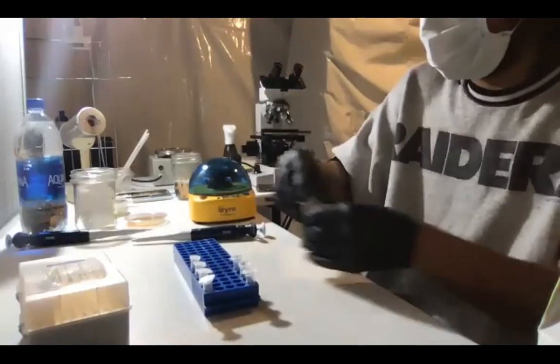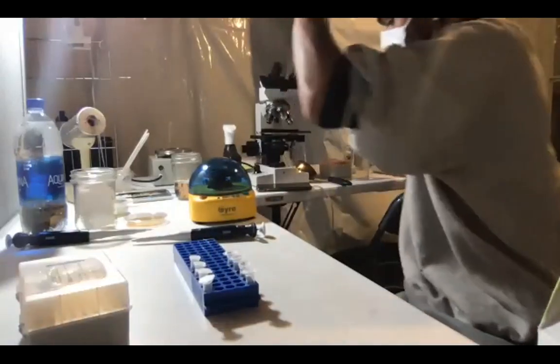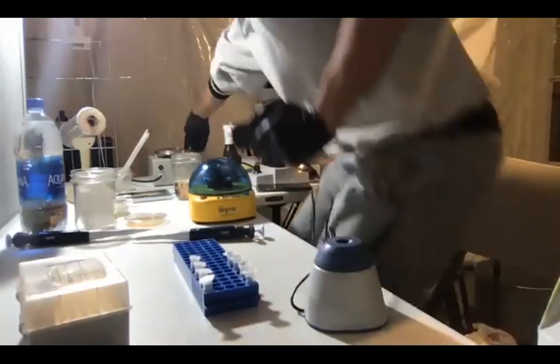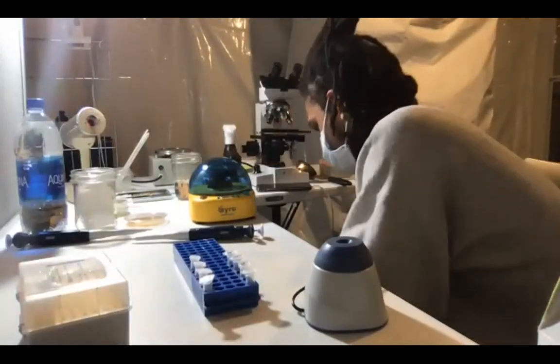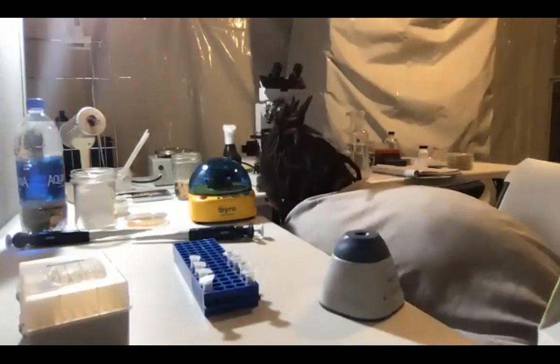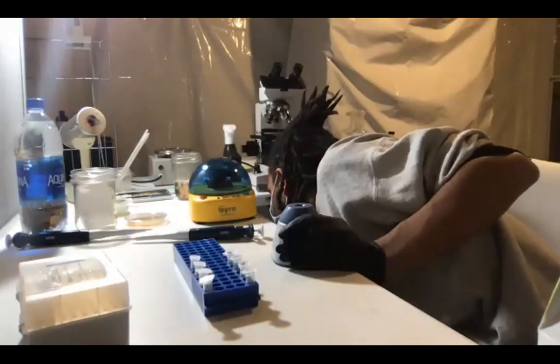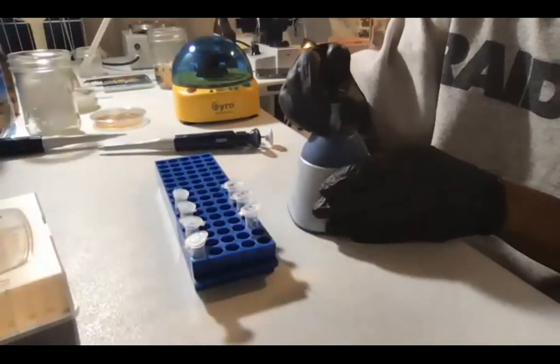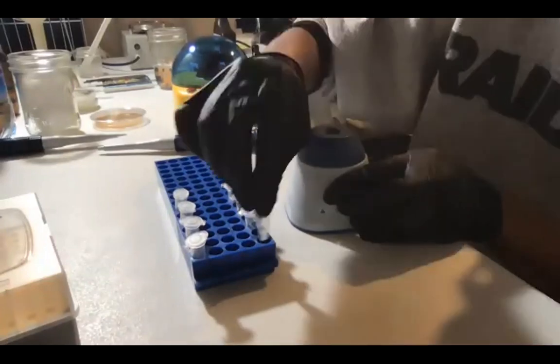If you want to get fancy, you can get a vortexer. And this helps get everything shaken up. I got this vortexer on eBay. Works really well. Basically what this does is it just shakes everything up into solution. So I just put it on there, and I don't know if you can see, but it starts spinning it and everything's all mixed up.